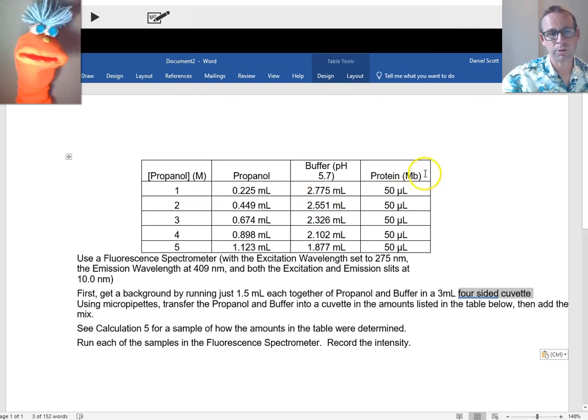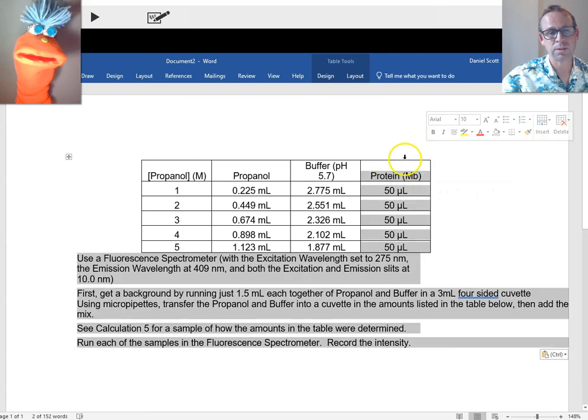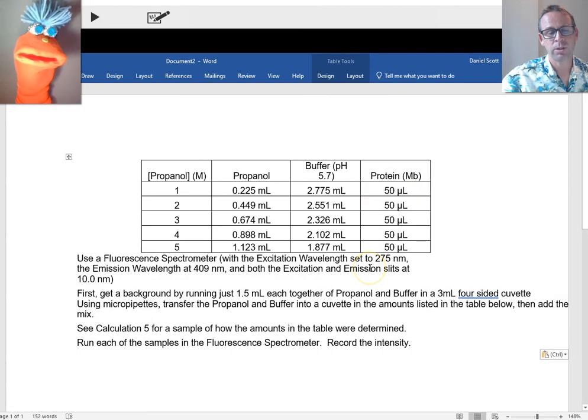You can look up protein fluorescence experiments using myoglobin, using heat as a source of unfolding, using urea as a source of unfolding, and let's compare it. Let's see if our data is comparable or if we're just looking at some anomaly. All right. Yeah, those are the things you want to discuss in your results, and you're going to want to find a paper that talks about that. Okay, great.